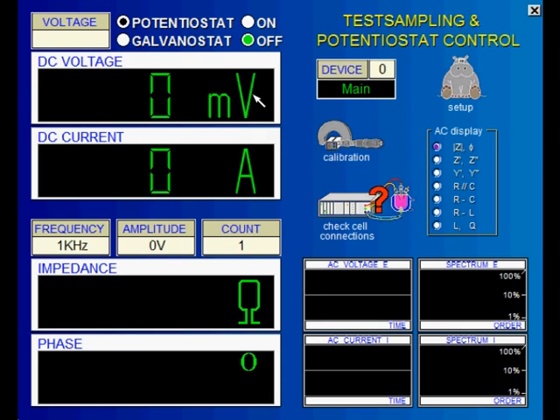If you have additional external potentiostats, electronic loads, multiplexer cards, or a noise probe installed, you may switch to one of these channels by clicking the DEVICE button. After doing that, all settings and displays on the control potentiostat page are related to this channel.